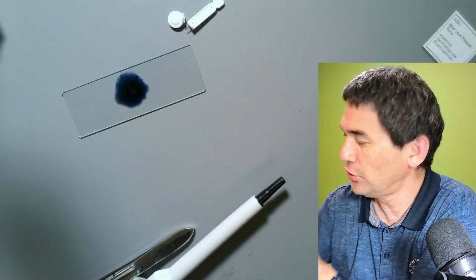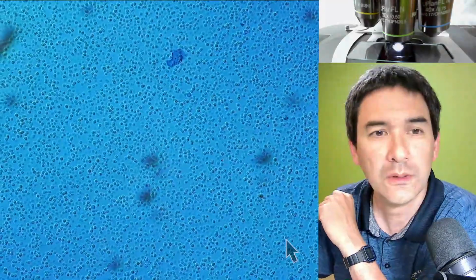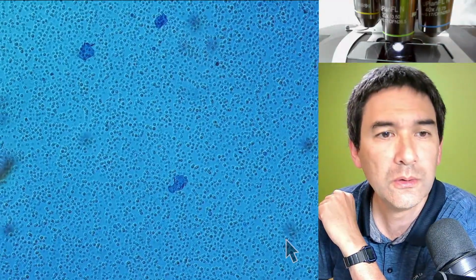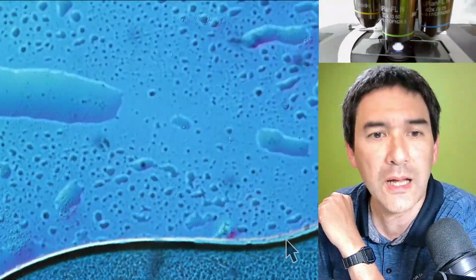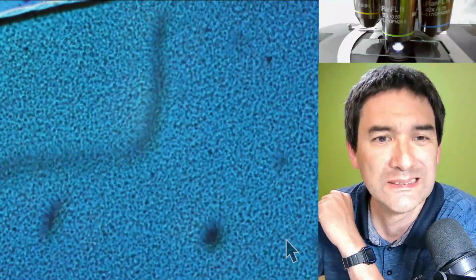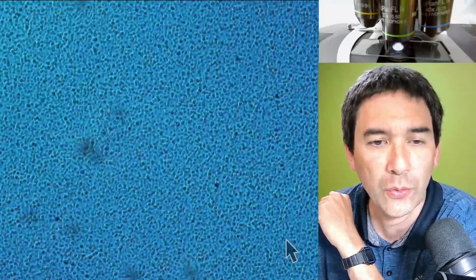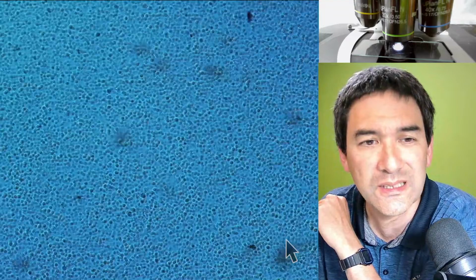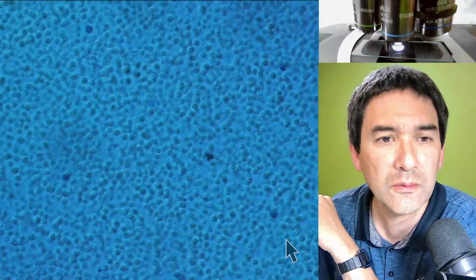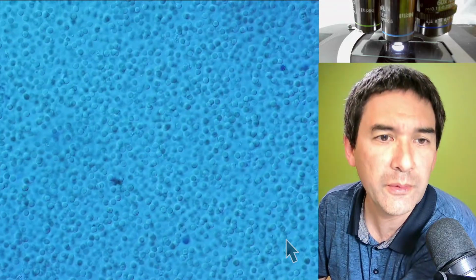I have to change to scope view. Here we go. Okay, wow, there's still some capillary action happening here, some movement. I have to wait maybe a minute or so for the whole thing to stabilize. And I think there are lots of cells. There are too many of them now.